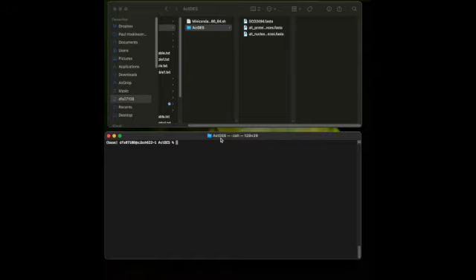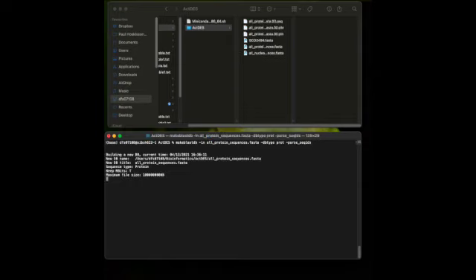So you can use the command makeblastdb, and then you tell it what your input file is, which in our case is going to be protein sequences, so all protein sequences FASTA, which is in the directory above. Then you tell it which database type, which is protein, and then you have to parse the sequence IDs. I've spotted a mistake in my command there. Okay, and then you can click enter, and it will start to build the new database.